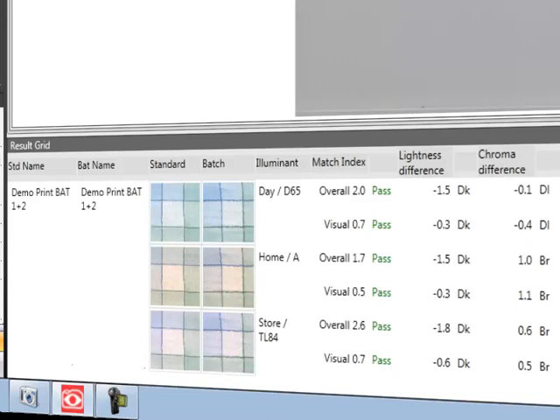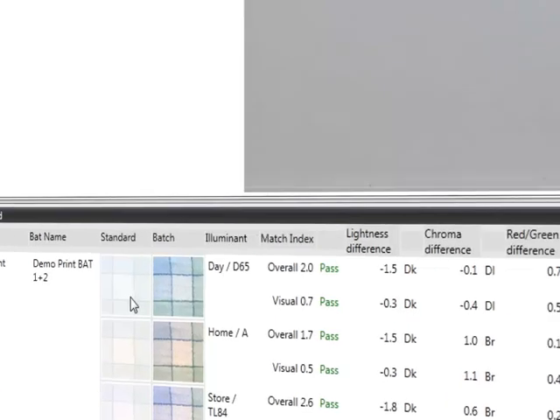The name of the standard and the batch are the same as the image by default, but can be changed by double-clicking the standard and batch name in the result data grid and changing them. The area sampled on the image can be shown by double-clicking the thumbnails in the result grid to show where the standard and batches were taken on the image.